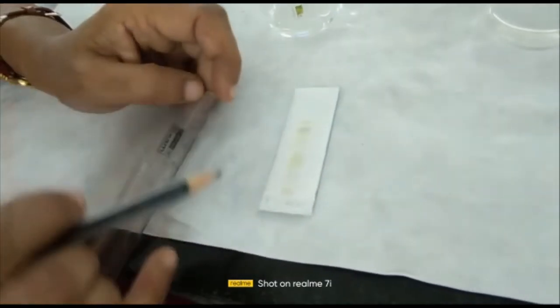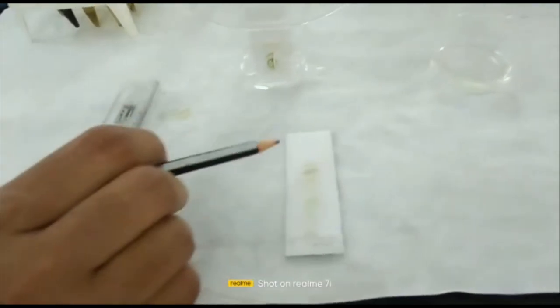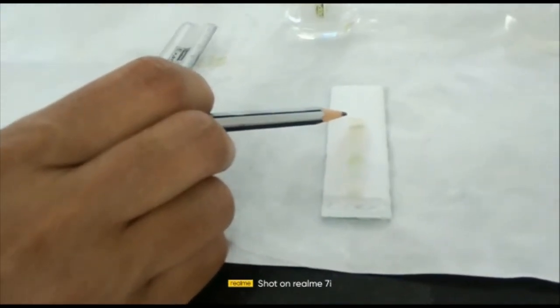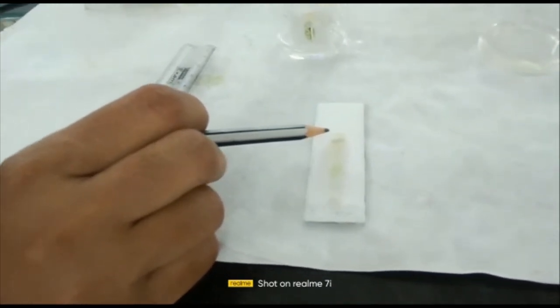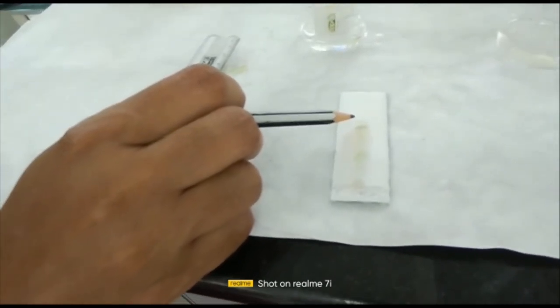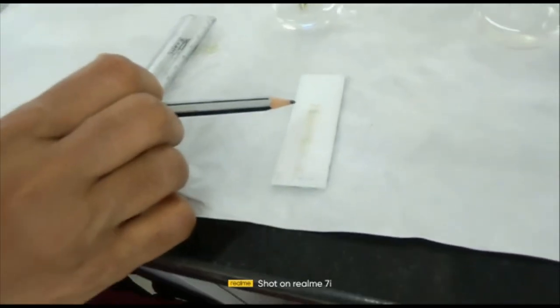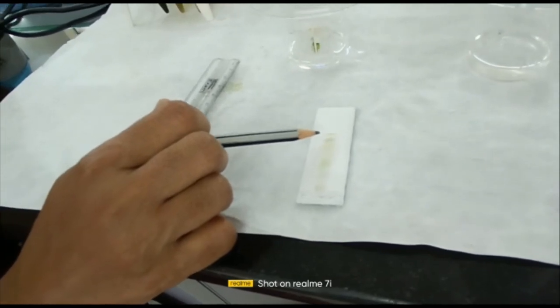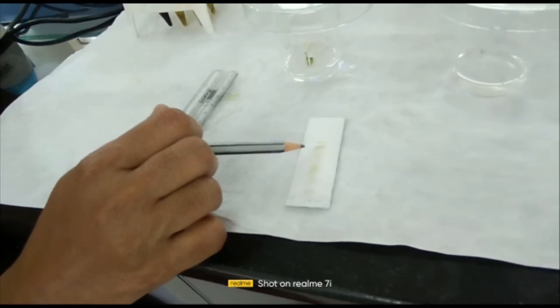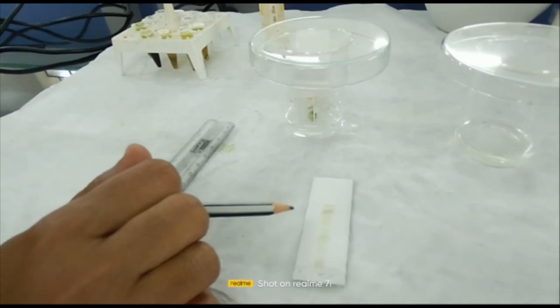As a continuation of this experiment, you can scrape out the TLC plate where the orange pigment is present, transfer it into an eppendorf tube, add some acetone, and extract the orange pigment into the acetone layer. Take it into a quartz cuvette and measure the absorbance in the UV region, as most plant pigments absorb in the UV-visible region. By measuring the absorption maxima, we can predict which plant pigments were separated using carrot and palak as samples.